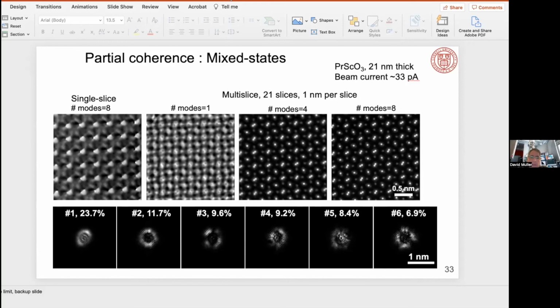And then the other one that's actually our biggest problem is environmental instabilities, that the electron beam is wobbling. There might be a little bit of flickering on the probe, changing the shape a little bit, not too much, but it might do a little bit. And all of that's getting folded into the multi-mode. Yeah. And then, I think Chris is saying, oh yeah, this is not an in-focus ptychography.